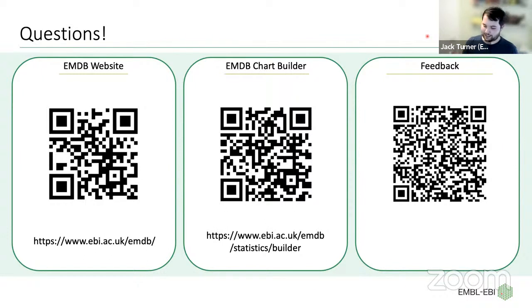On the side of EMPIAR metadata, between the EMDB and EMPIAR, we don't want to duplicate too much metadata. We don't want people having to enter things twice, but also we don't want redundancy between the archives. There is a slight issue though, in that EMPIAR is not yet an affiliated archive of wwPDB. That is planned, but it's not yet there. And until it's affiliated, we can't share the metadata between the archives. That's just the rules of having to keep things confidential in each of the archives.